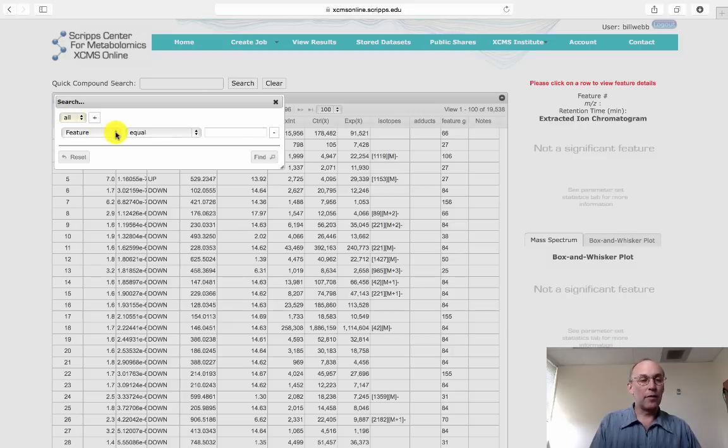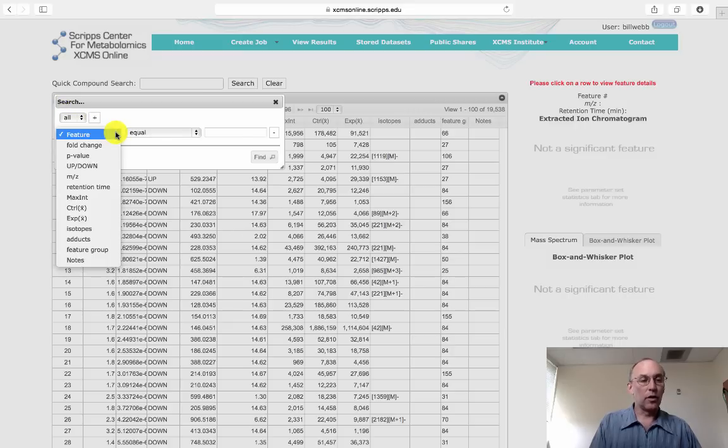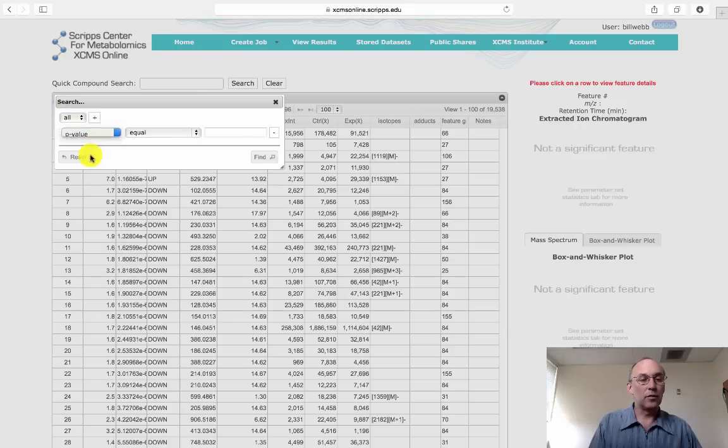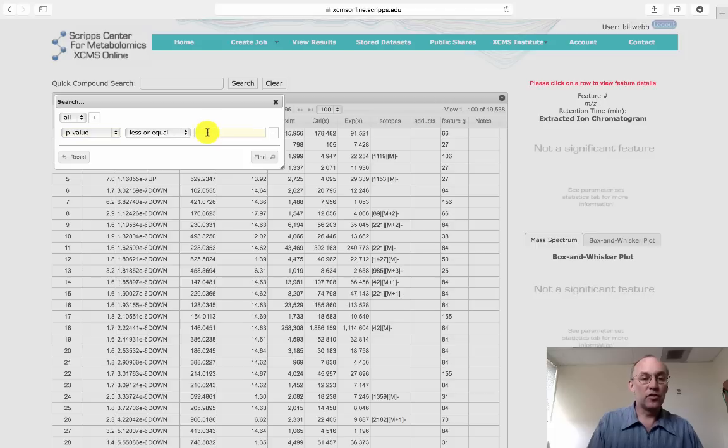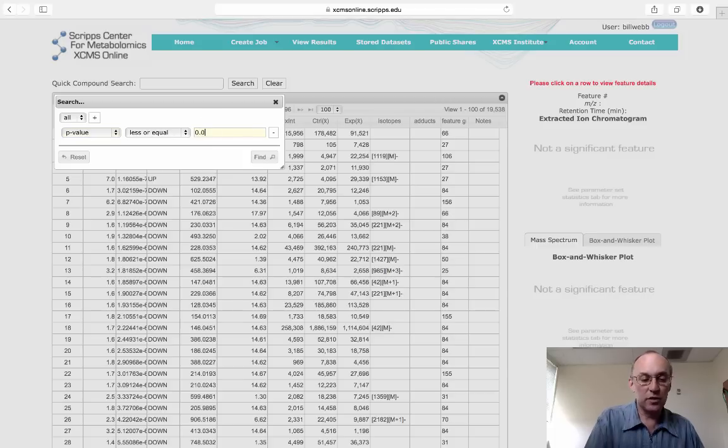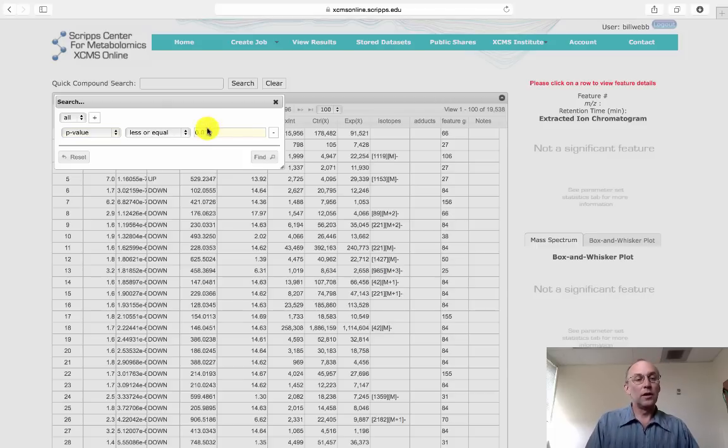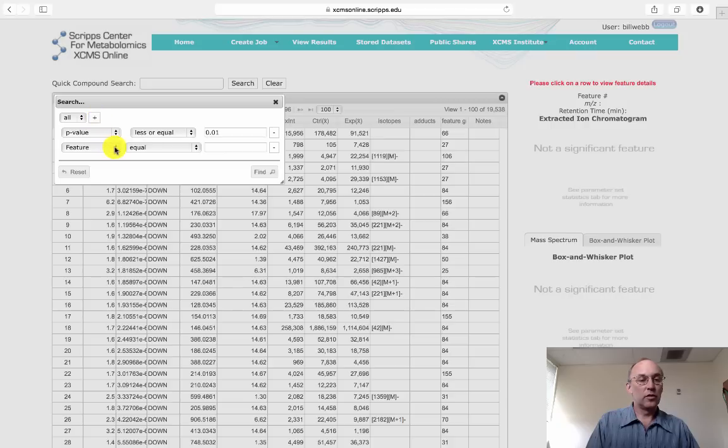And the first parameter we're going to filter on is p-value. We only want to look at features that have a p-value of 0.01 or less.